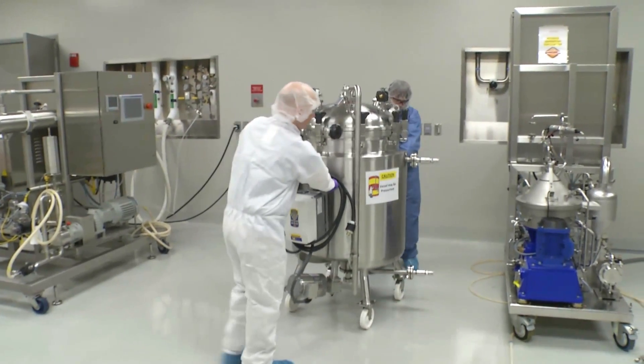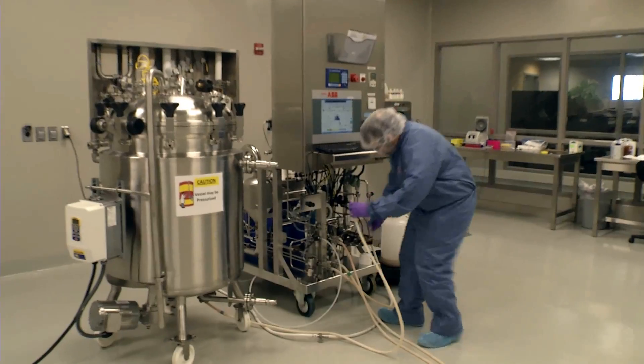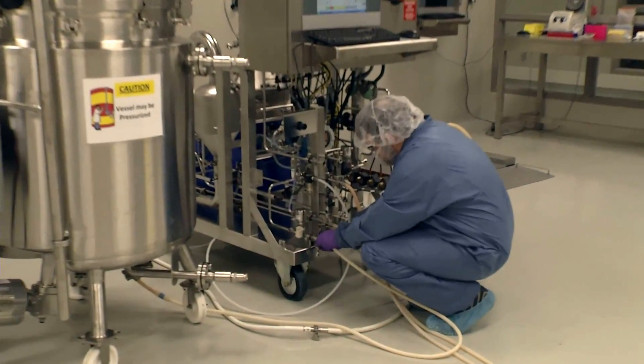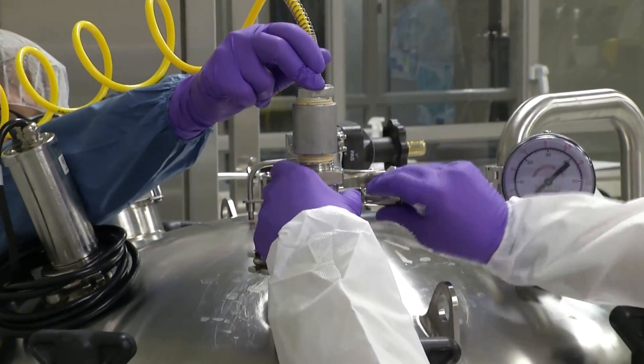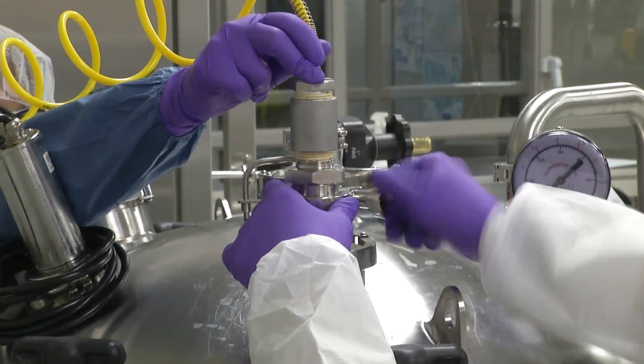GFP recovery begins with the arrival of the broth tank. A sterile hose is run from the broth tank to the disc stack centrifuge and the tank is pressurized to drive the broth into the centrifuge.